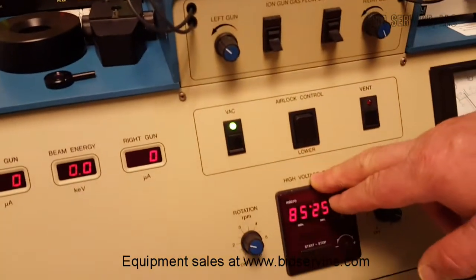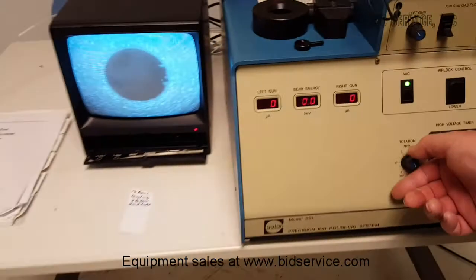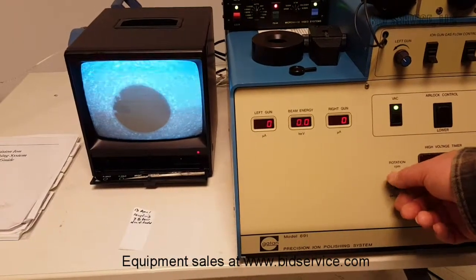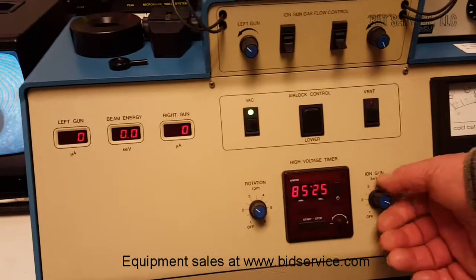You have your timer here, and also your rotation control — I can speed up the specimen speed, as you can see if you look over at the camera, and I can slow it down and shut it off. Over here you've got your power controls to supply power to the system.